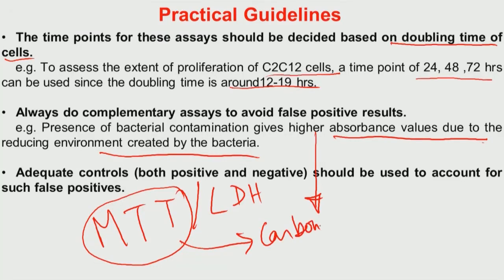Now if you use these carbon nanotube based materials or any other carbon based materials, for example graphene based materials, you want to understand their toxicity towards specific cell lines, one cannot use that MTT assay. So for that you need to use certain other specific assays. Because that MTT reagent interacts with carbon and therefore it gives a false reading which may not reflect the mitochondrially active cells in that particular solution.